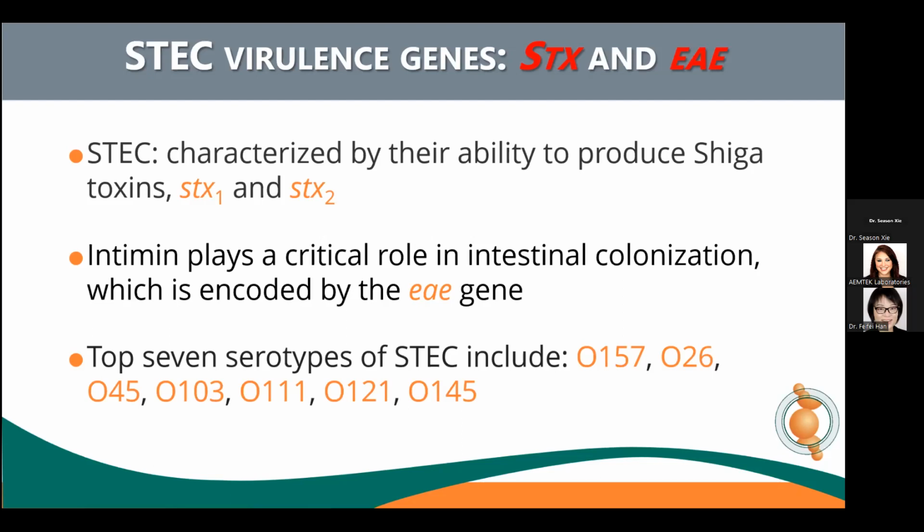Multiple genes that enable STEC strains to attach, colonize, and produce toxin proteins have been identified. In a subset of STEC strains, intimin plays a critical role in intestinal colonization, which is encoded by the eae gene. We will discuss the stx and eae genes in the next slides.